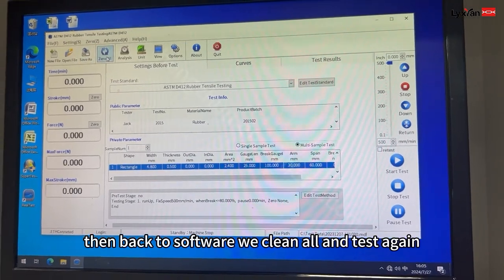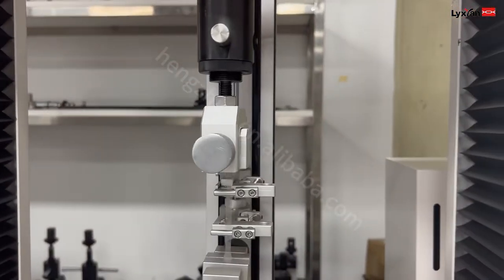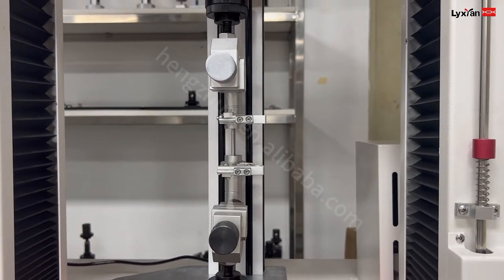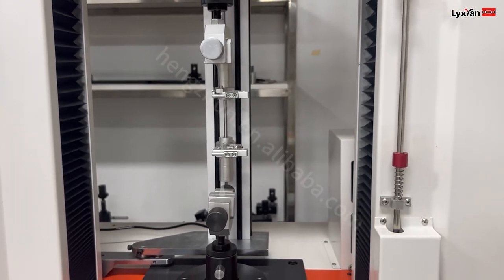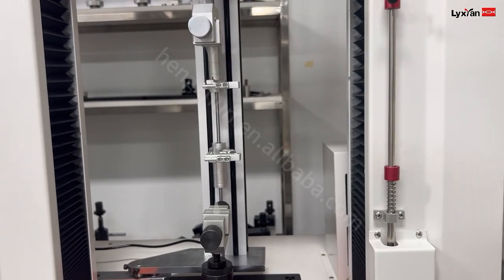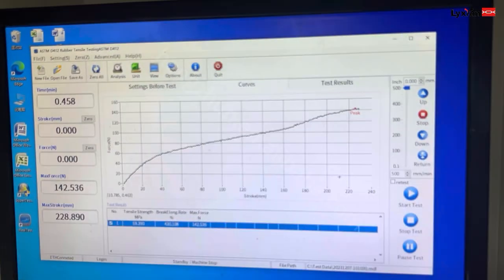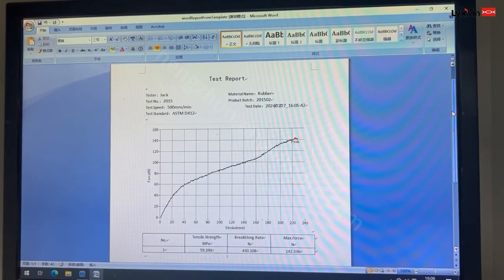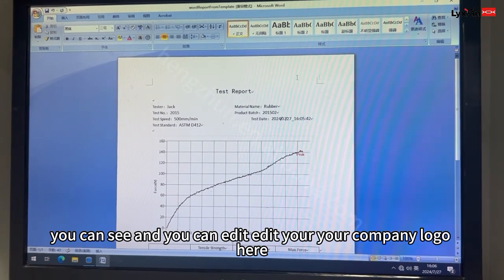Now back to software, we are clearing all and testing again. And then we export the report. As you can see, you can edit your company logo here.